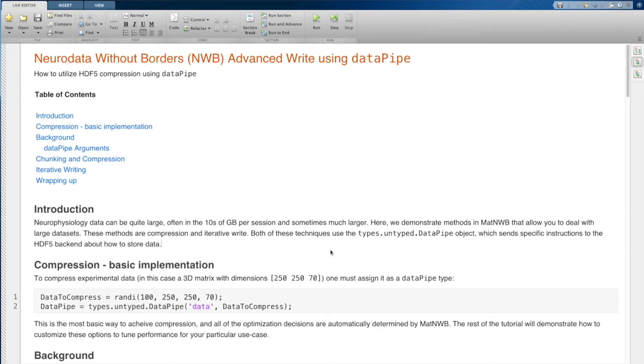If you're using MATNWB and you have very large data that's cumbersome, this tutorial could help you deal with that data.